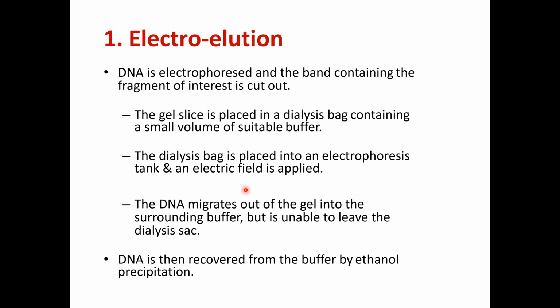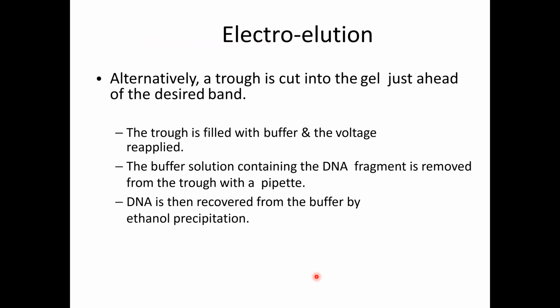The DNA is then recovered from the buffer by ethanol precipitation. Class, always remember that if you are going to recover nucleic acid fragments, you should add ethanol because it precipitates the DNA so you can extract it properly and conveniently.